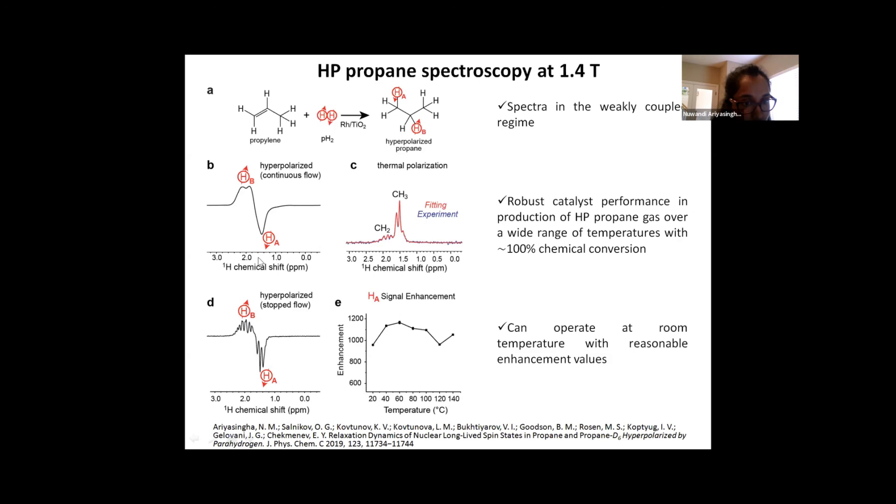So this spectrum which is shown under A was acquired in a continuous flow condition. And this one was acquired at a stopped flow condition and the spectrum of thermally polarized spectrum is given in C. And we also studied the effect of the temperature towards the enhancement. So from plot E here, we can say two important things. One is that a robust catalytic performance is expected over a wide temperature regime. And the second one or the more important one is that we can still get reasonably high enhancement values by operating the catalytic reactor at room temperature. So this is great because we don't have to go for high temperatures for HP propane production.